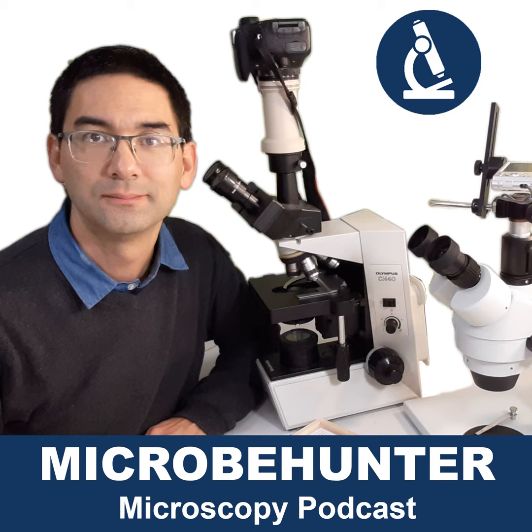Okay, so I would say that when going out and shopping for a microscope, magnification is one of the least important parameters, which is a little bit ironic, I have to admit, because isn't this the point of a microscope, to make small things larger, and then all of a sudden I'm saying it's actually one of the least important ones. The reason I'm saying this is because microscopes already cover such a wide range of magnifications that you're covered right from the beginning anyway.